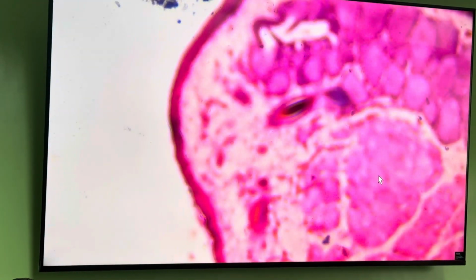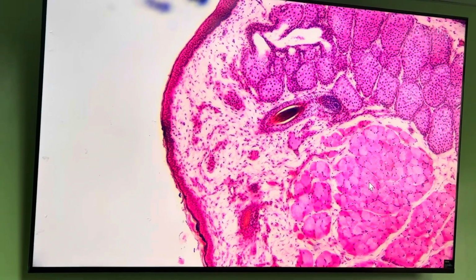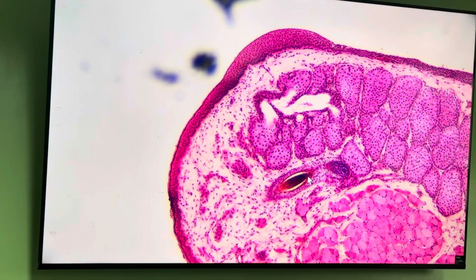So, and then we have the human eyelid slide. So for girls, I think this is the trend. Am I correct? For Kuya James. Okay, so yung iba sa inyo, ito pinapa-extend.